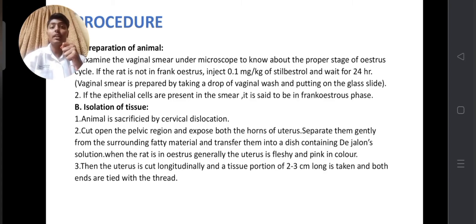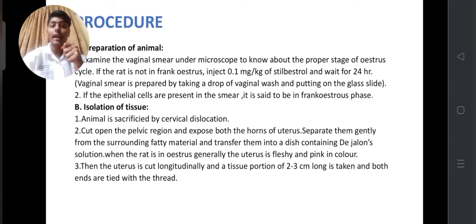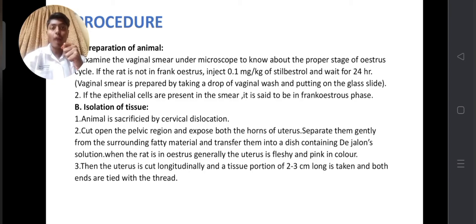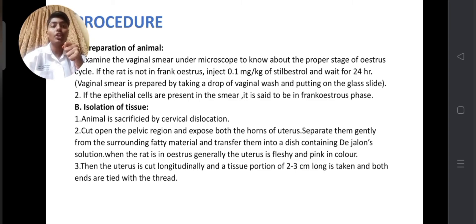The second procedure is isolation of tissue. First, the animal is sacrificed by cervical dislocation. Second, cut open the pelvic region and expose both horns of the uterus. Separate them gently from the surrounding fatty material and transfer them into a dish containing De Jalon solution. When the rat is in estrus, the uterus is generally fleshy and pink in color. The uterus is then cut longitudinally, and a tissue portion of 2–3 cm long is taken with both ends tied with thread.